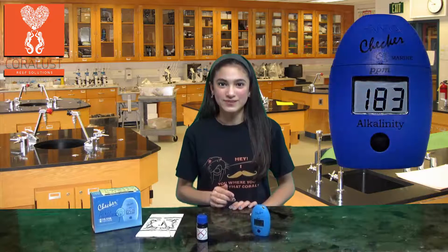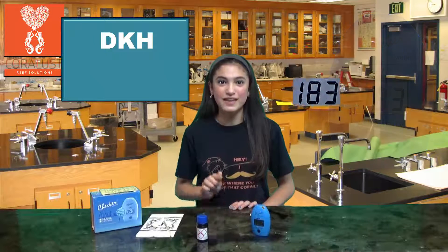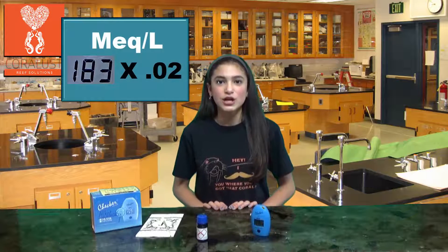A number will be displayed. If you are looking for dKH, you have to multiply that number by 0.056. If you are looking for milliequivalents per liter, you have to multiply that number by 0.02.